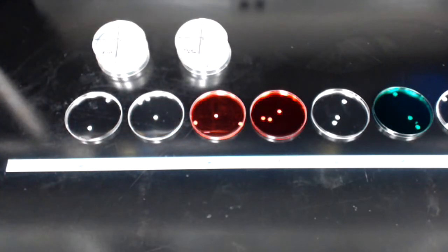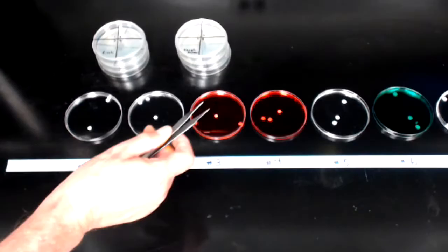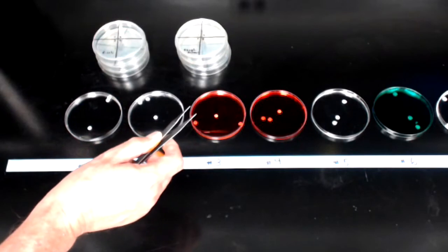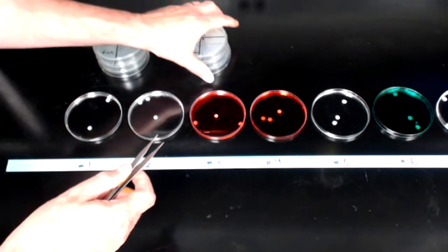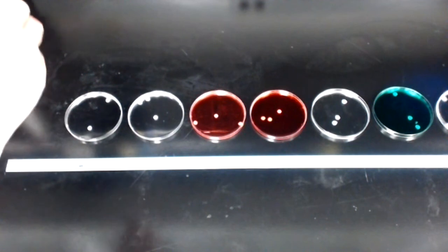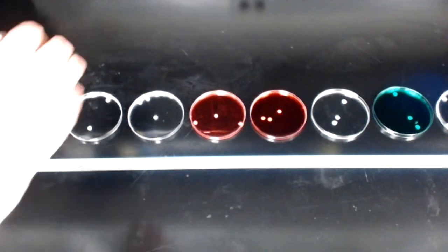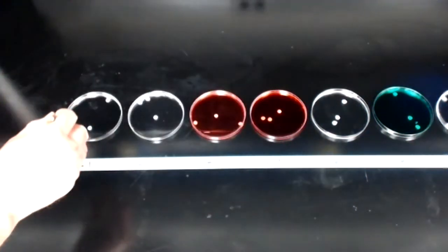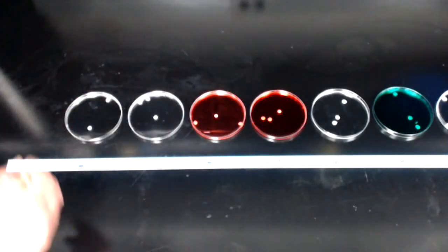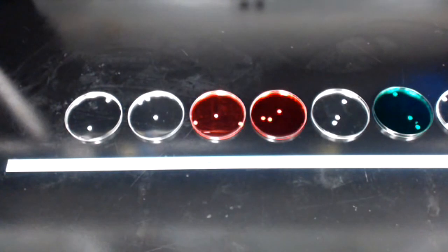So in order to do this, I will be using a forceps. The tips of this forceps have been sterilized. And so what I'm going to do now, I'm going to push these plates out of the way. I'm going to grab the first E. coli plate that has the numbers 1, 2, 3, and 4 on it, and I'm going to take discs from dishes 1, 2, 3, and 4 and transfer 1 disc from each of those 4 dishes onto the surface of this E. coli plate.